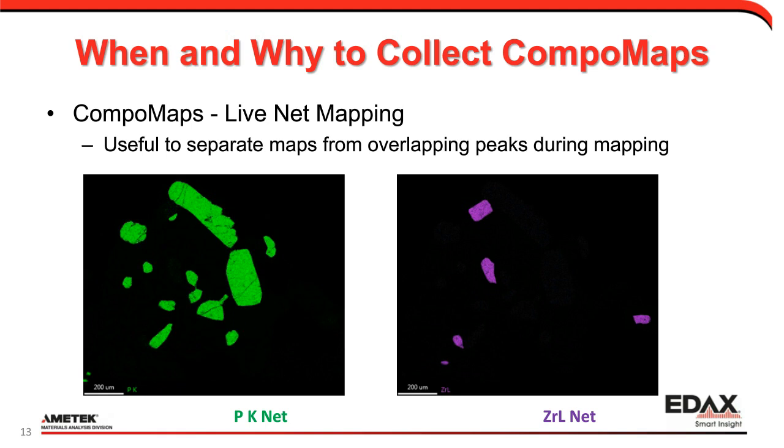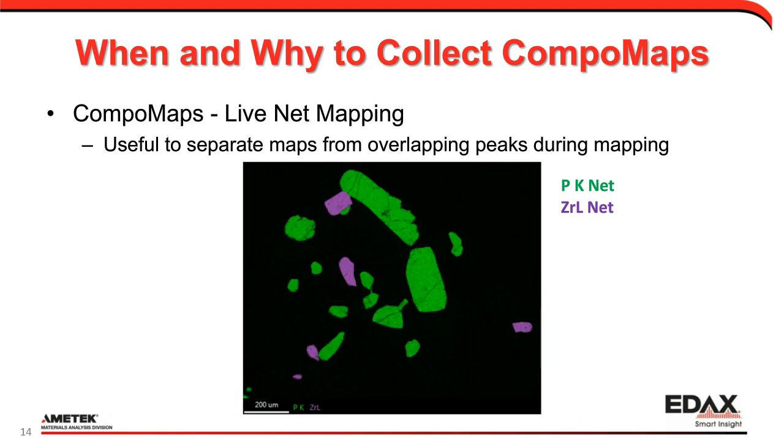I always like to do an overlay of the two so you can really accurately compare the difference and confirm where they are. Now, recently, a user from a prominent university made what I thought was a great comment, and he said, when I was looking at the ROI maps, those compounds didn't make any sense at all.